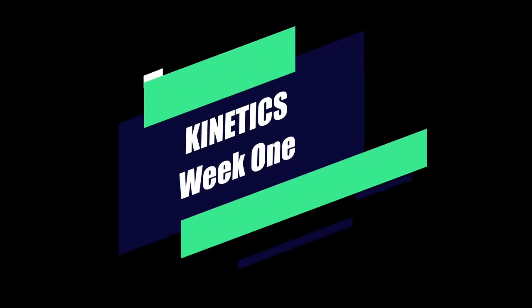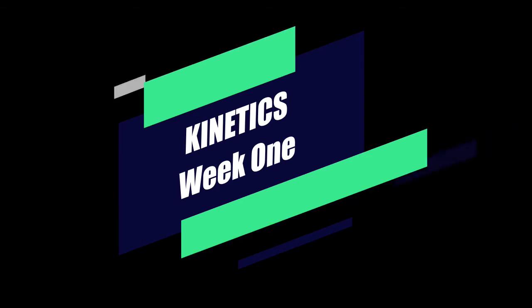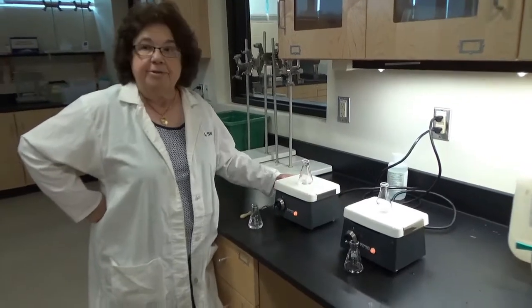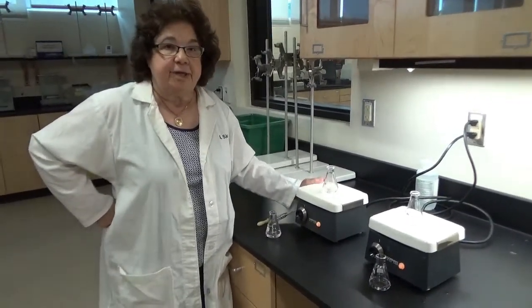This is the first week of a two-part lab on chemical kinetics. So I'd like to do a little demo that shows you the effect of adding thiosulfate to this reaction.